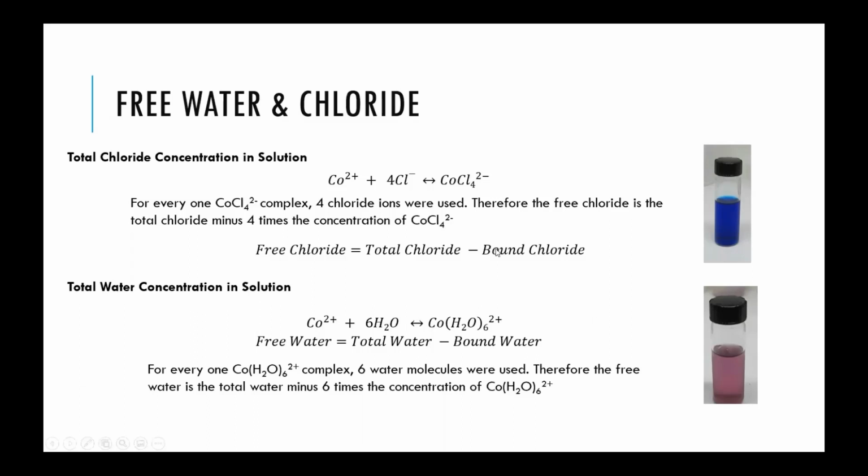If you subtract these two, then you end up with the total free-floating concentration of chloride and free-floating concentration of water.